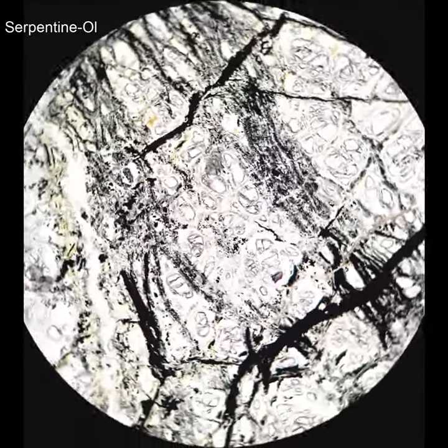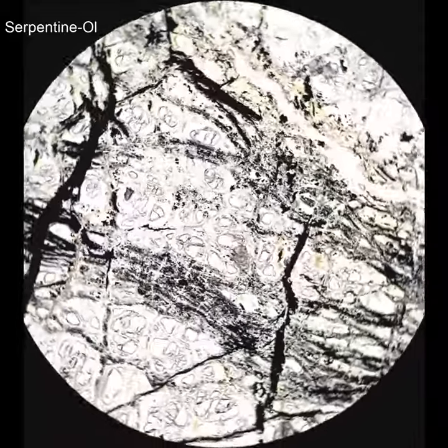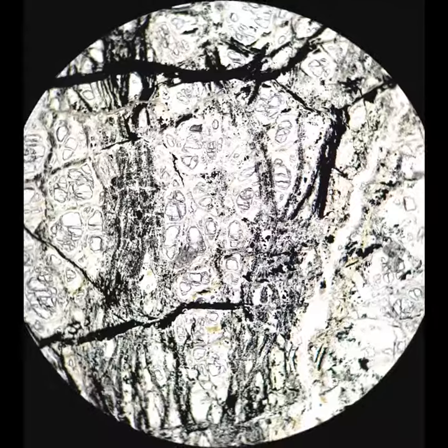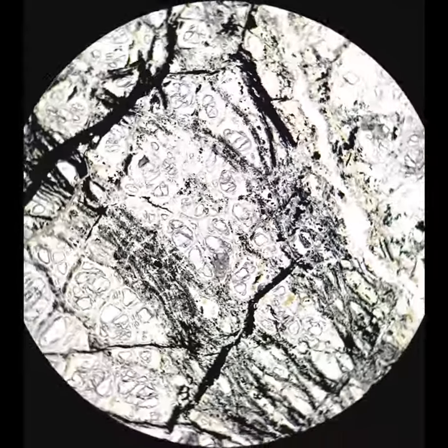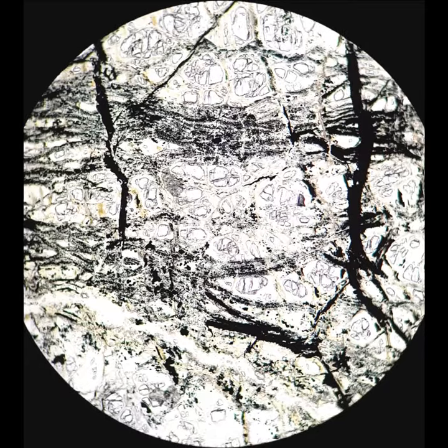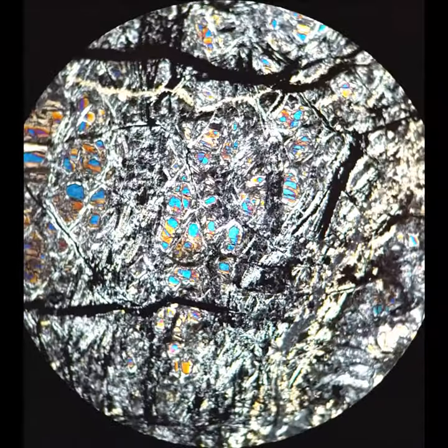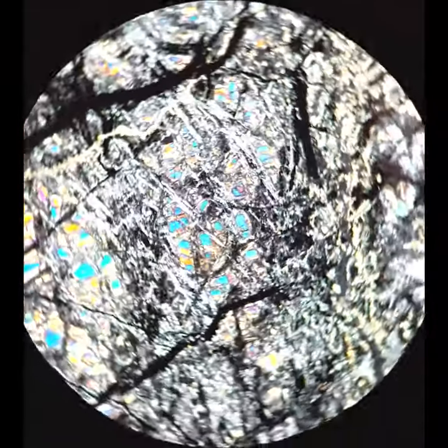This is fairly typical serpentine forming as an alteration product after olivine. The high-relief islands in there are olivine grains — when I cross the polars, you'll see they have high birefringence. The serpentine is that vein network with low interference colors, fine-grained material in between the olivine grains.